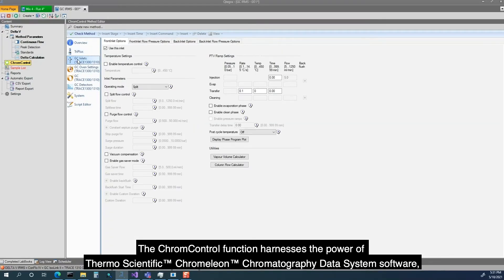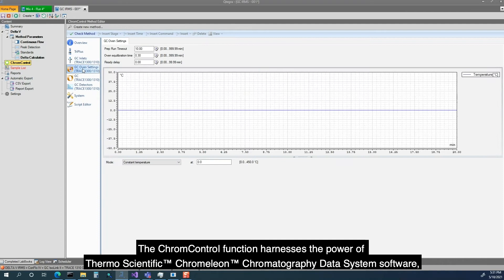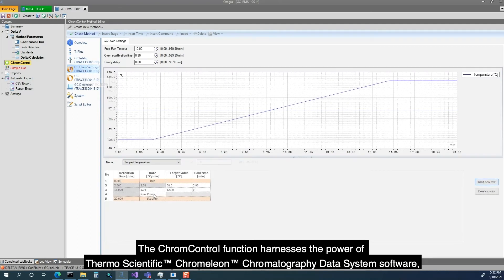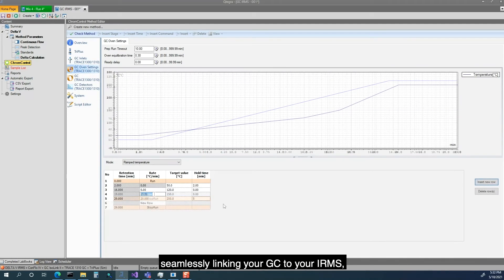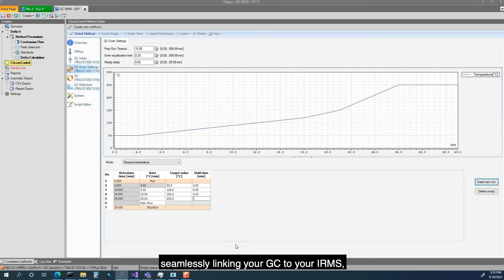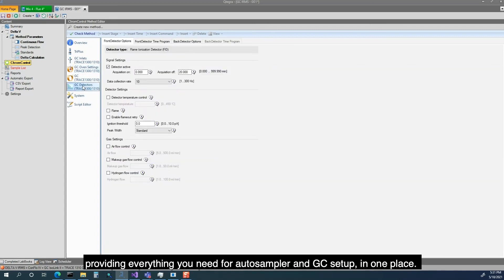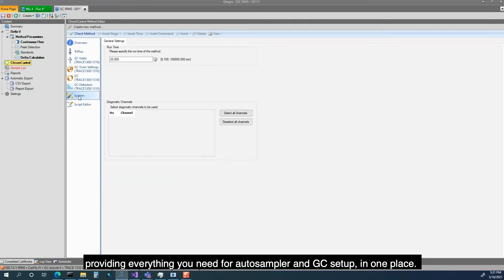The Chrome control function harnesses the power of ThermoScientific Chromelion Chromatography Data System Software, seamlessly linking your GC to your IRMS, providing everything you need for autosampler and GC setup in one place.